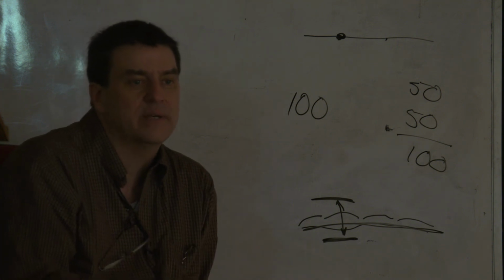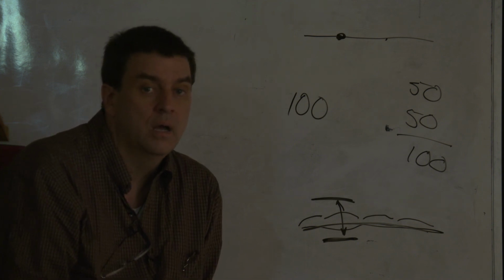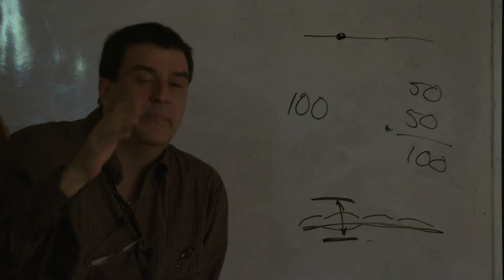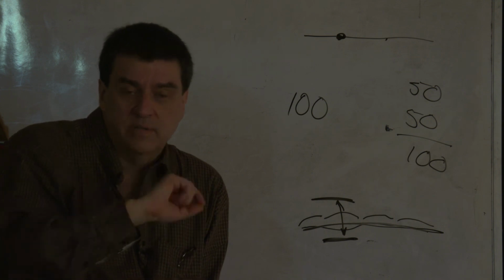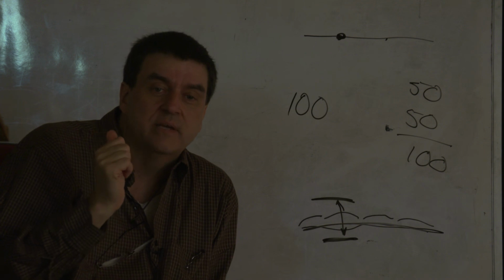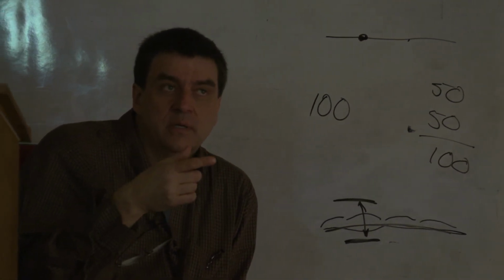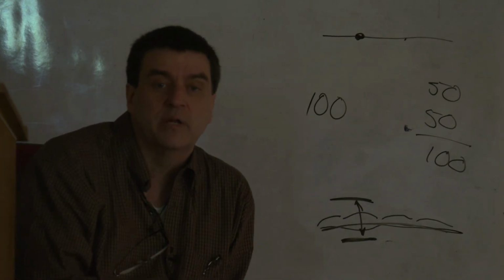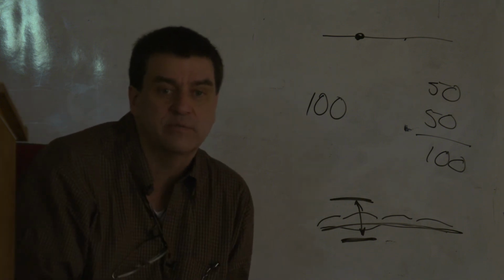Okay. Other questions? What is the optimum pinhole diameter to get maximum resolution? Okay, the optimum pinhole diameter is determined by what objective you're using and what its numerical aperture is. There's a formula for that. But on these confocals these days, you put in the wavelength you're going to use and the objective you're going to use, and it calculates the optimal pinhole for you. It's good to know about it, but the machines these days automatically do it for you.